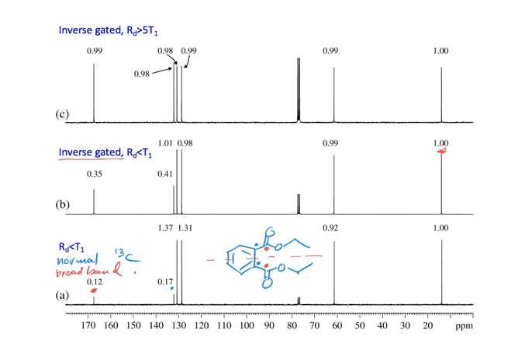If you think back, have you run C13 spectra? No, well, I'm teaching spectroscopy right now. And so I'm looking back at the spectrum, or the multiple spectra, and I think I see that. I think I'll have to double check it. It's usually always, especially carbonyls are almost always small.